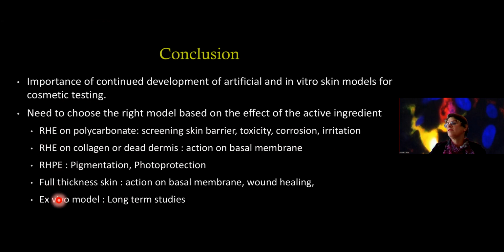Full thickness skin and ex vivo model we can keep for a longer time. You can also test some molecules in chronic. It's better to use them. You can do wound healing, and you can analyze some action on basal membrane.